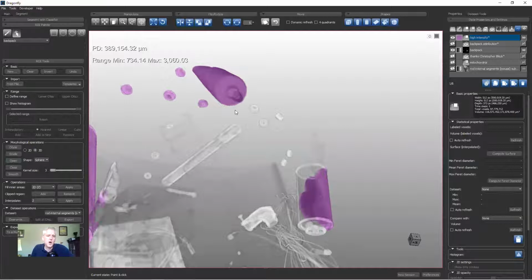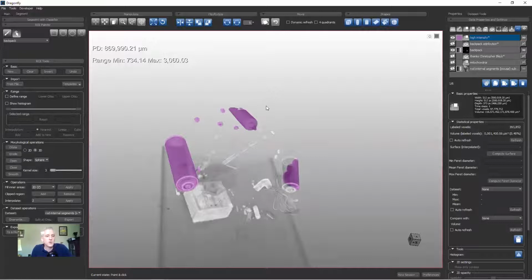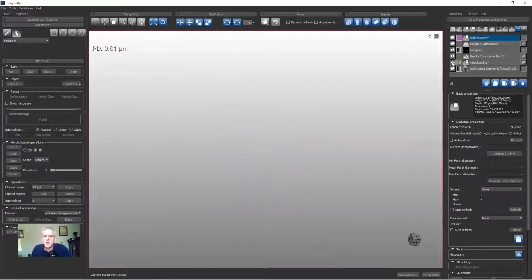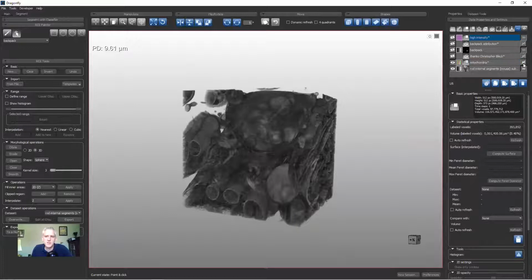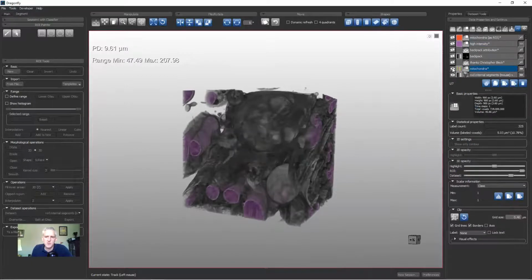It did. Okay, so we've looked at point and click in the 3D view, we've looked at the paintbrush in the 3D view, and we've looked at these tools in the 3D view. I think that's probably almost everything we're going to cover. I did want to show one more thing on the mitochondria. In this case, I have my 3D image channel of the mitochondria, and I have this segmentation. This is a multi-ROI. I'm going to right-click and make a new ROI from it.